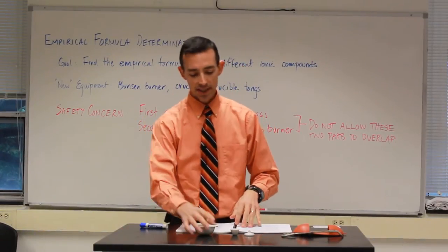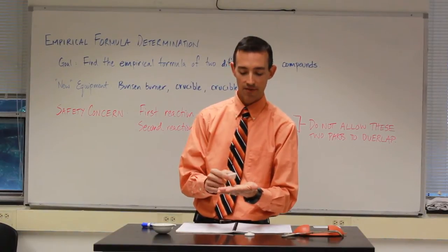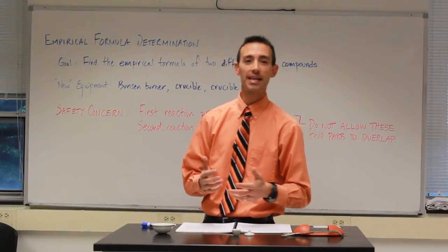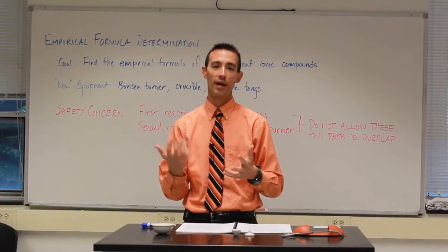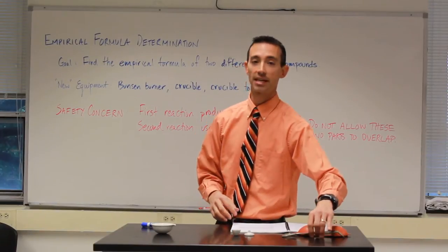So here's an example of the crucible, this small porcelain object that I have in my hand. It's quite tiny and rather delicate, although it can withstand high, high temperatures, direct flame from our Bunsen burner. And I'll show you in a second how we're going to set it up.